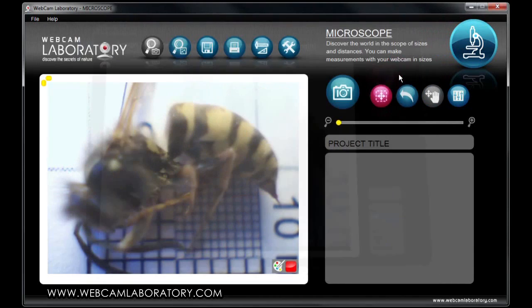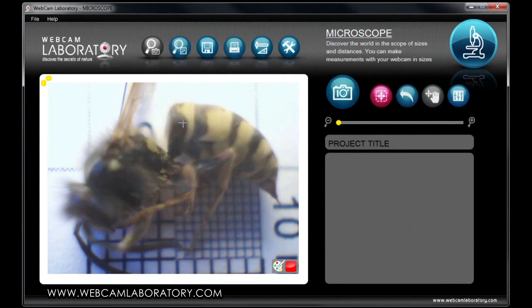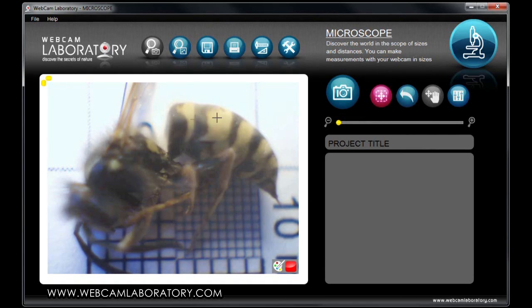Once this is successful, you can close this window — your setting is now complete. All measurements you take from this point on will be in real sizes. For making a measurement, select the measuring button and make the measurement by clicking on the picture, just the same way as you did before on the size calibration picture.